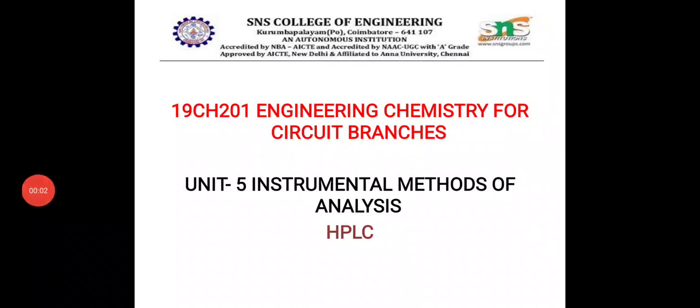Yes, dear friends, another important analytical instrumental method of analysis is HPLC, high performance liquid chromatography. Yes, it is an advanced chromatographic technique.